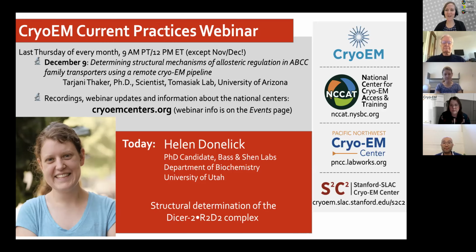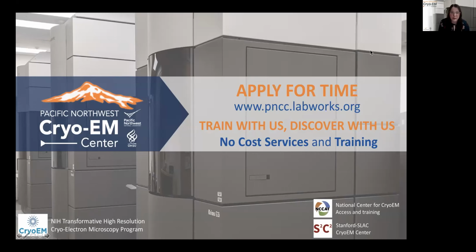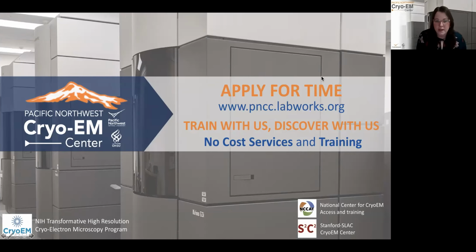With that, I'm going to turn over to our center representatives, and I'm going to let Lauren go first. Awesome. Thank you, Christina. So my name is Lauren Vega, and I'm the project coordinator for Pacific Northwest CryoEM Center. So we currently offer one proposal type, both for single particle analysis and tomography, giving up to 480 hours a year for 2 years. We do have a monthly submission deadline for applications on the first of each month, and each one of our proposals is delegated what we call a SPOC, which is a scientific point of contact, in order to discuss your scientific questions.